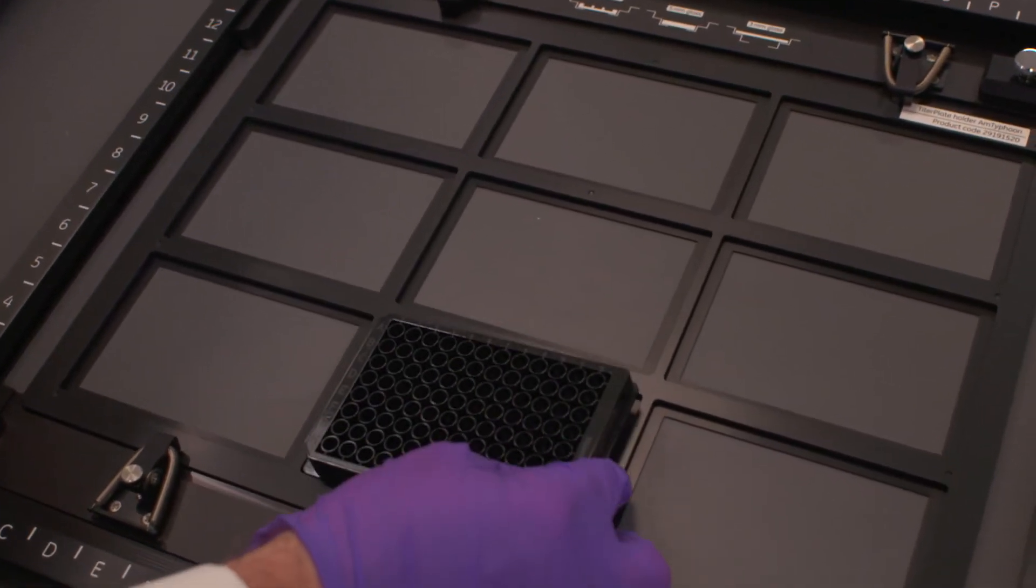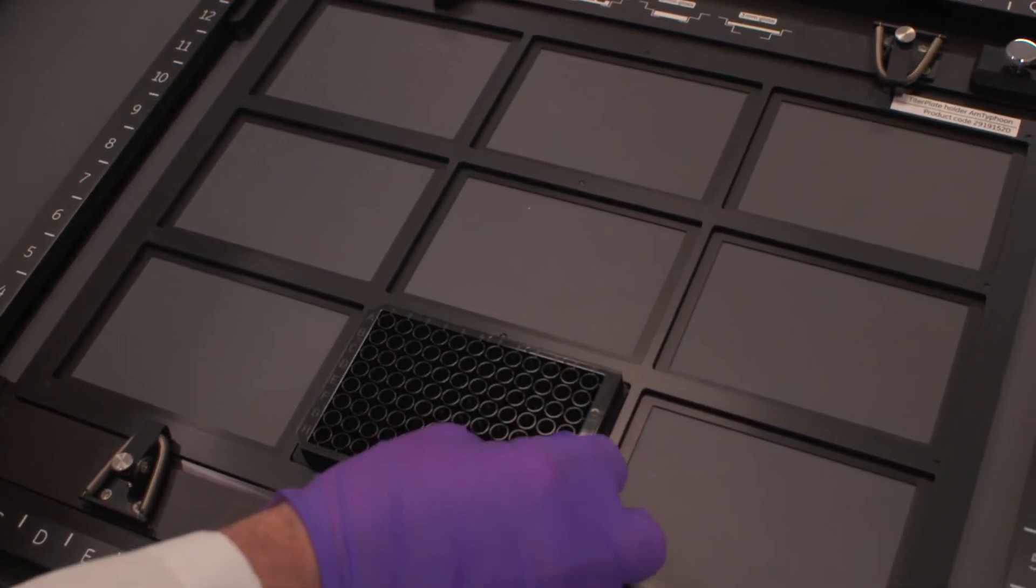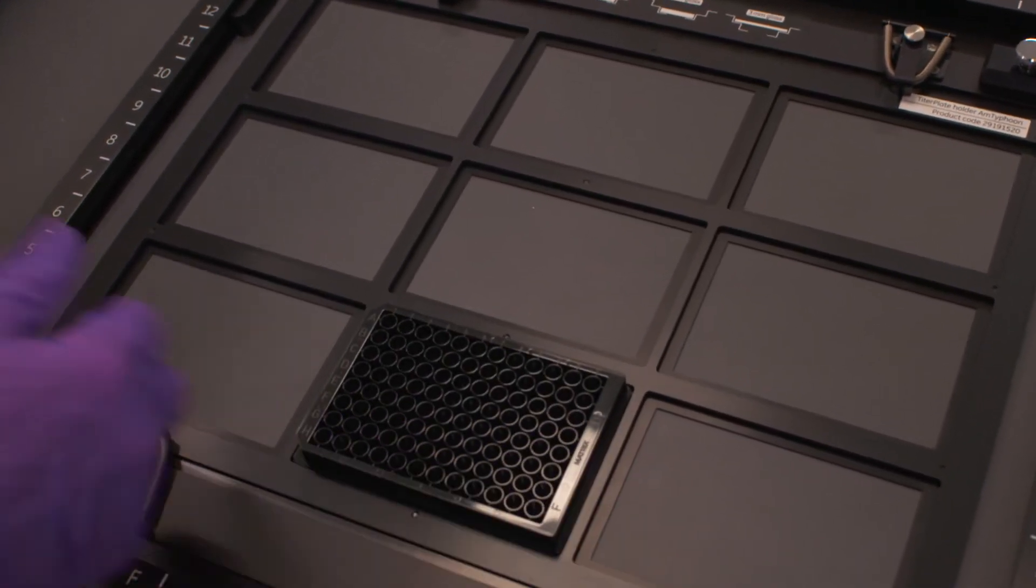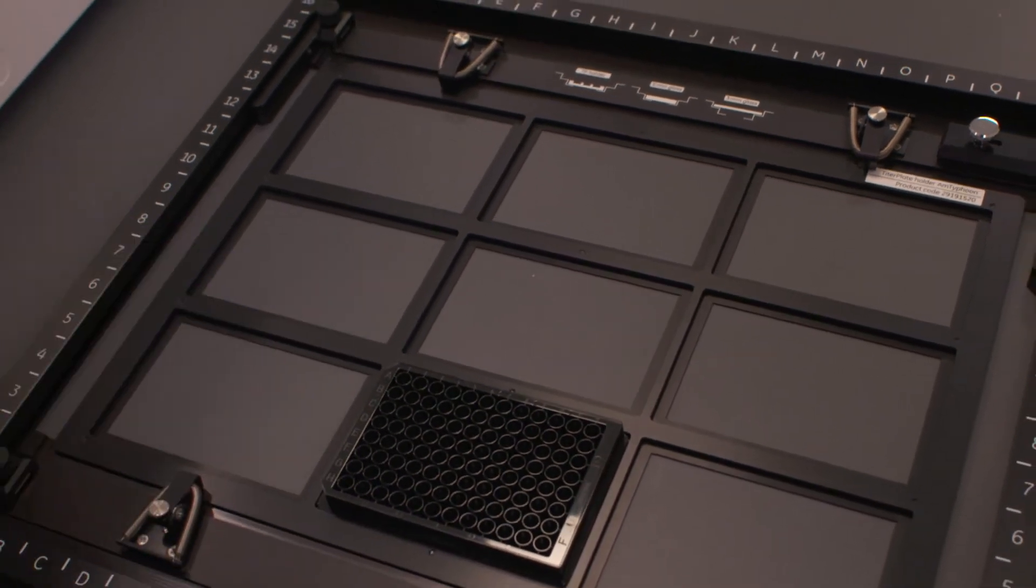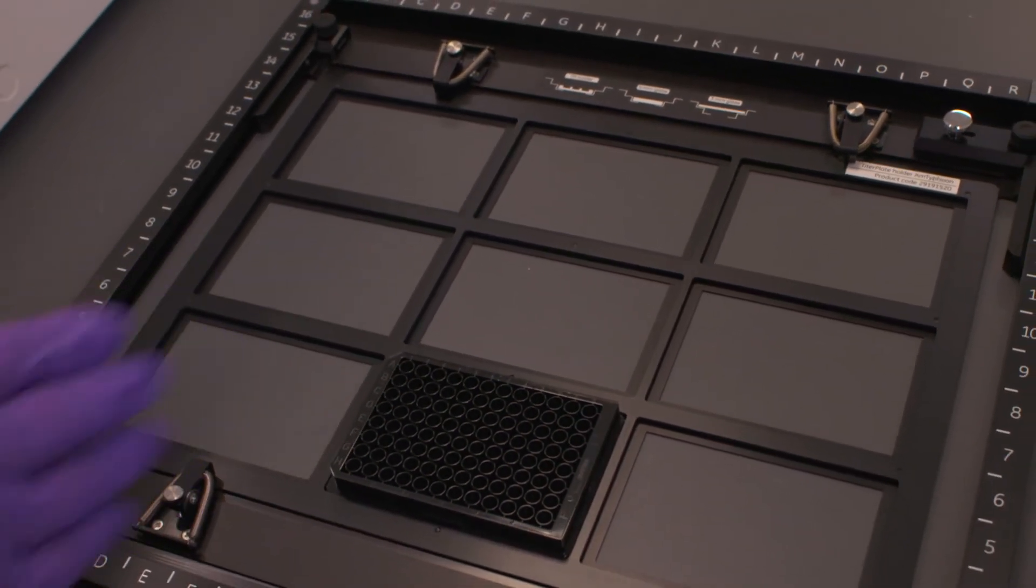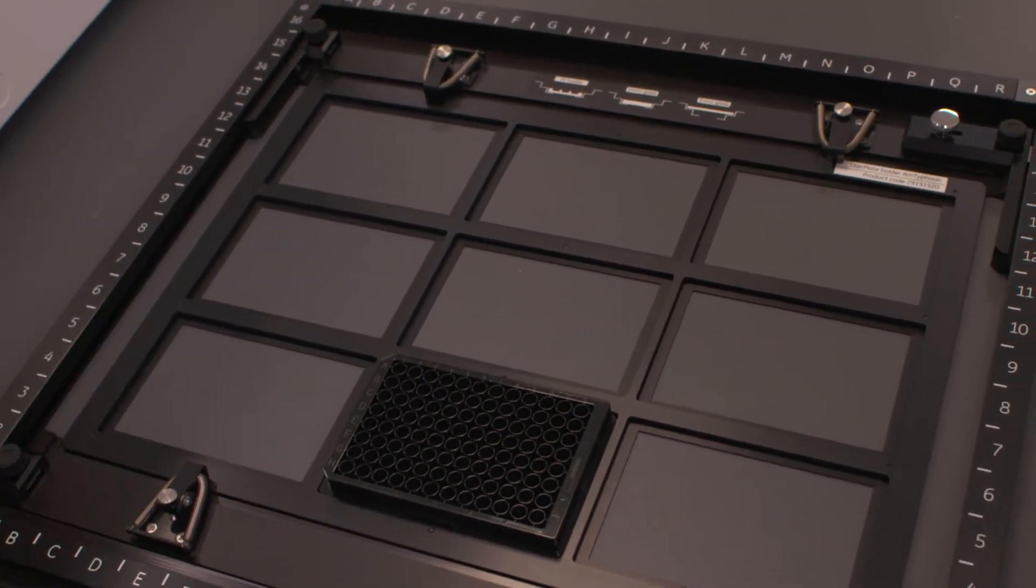We can place this in any of the nine positions on here, so it obviously enables us to do up to nine. In this case, we're just going to use one micro-titer plate.